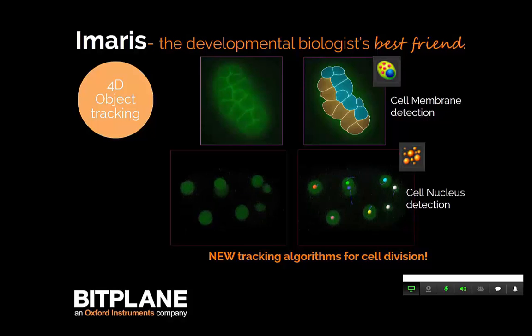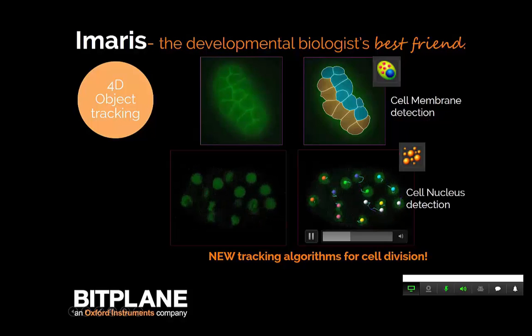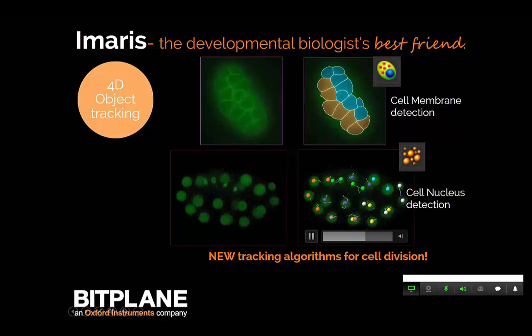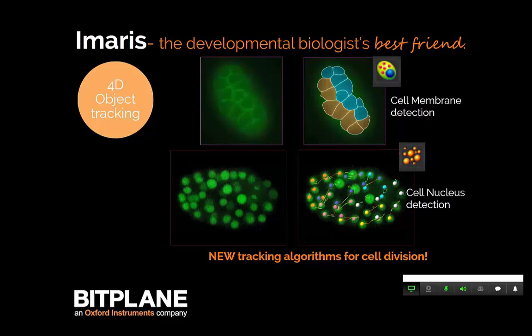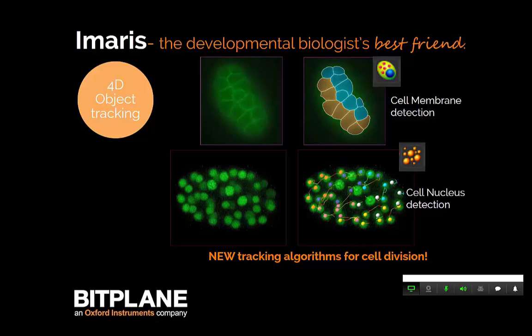So I'm going to click to show you this new feature that was launched a little earlier, where we can not only detect where each of the spots are, but also detect the division between two spots. These particular spots have been labeled so that we can see the fate of the cells that were in the original time point. So this makes it easier to visualize those divisions and also to see where those cells end up.